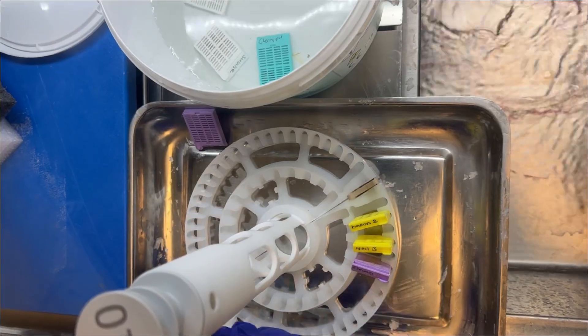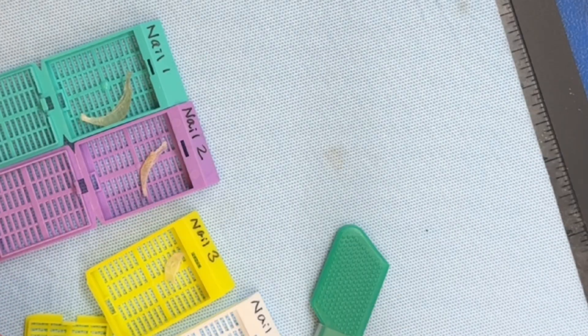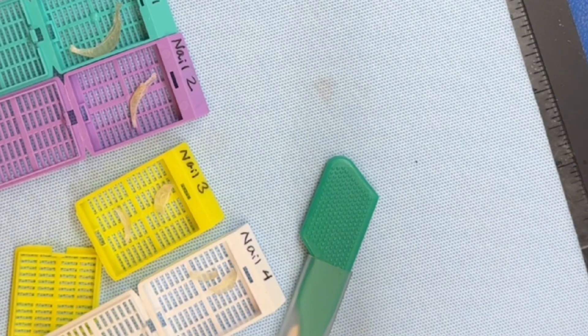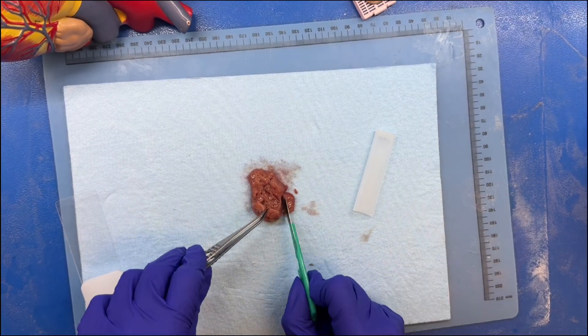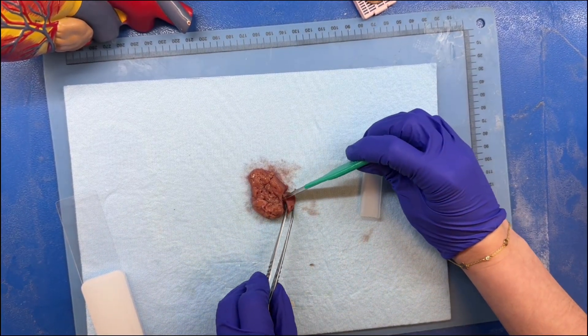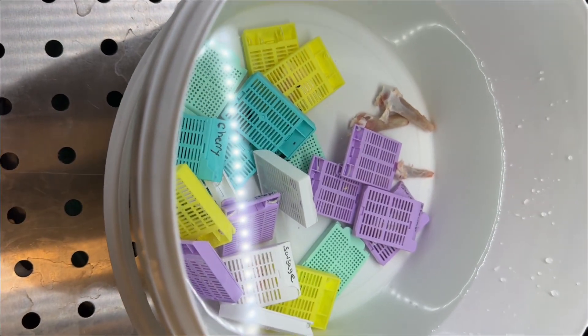To start the experiment, we first took the nail specimens through standard tissue processing steps. We began with grossing, which in this case just meant placing the nail specimens directly into cassettes at the grossing station. Normally we would cut larger specimens into smaller pieces, but since nails are already tiny, they were ready to go straight into the cassette.